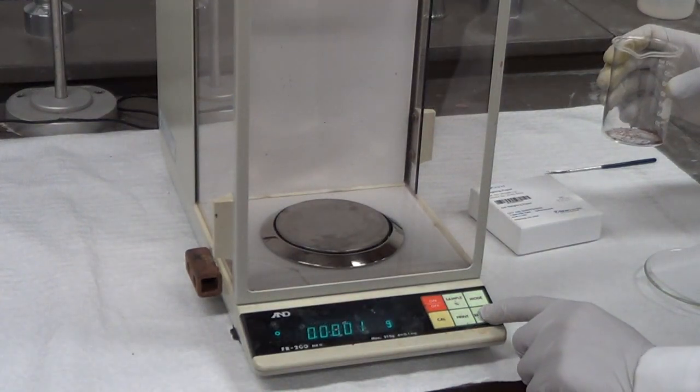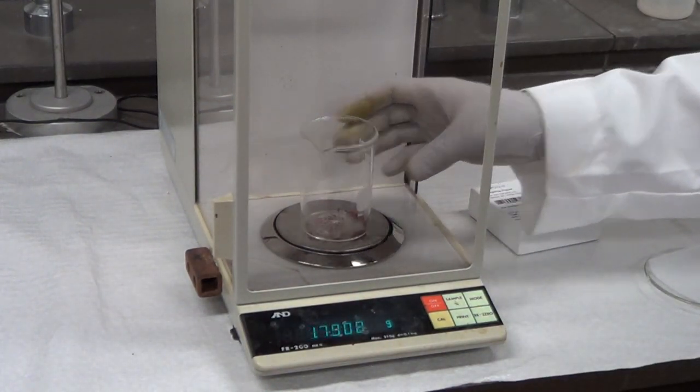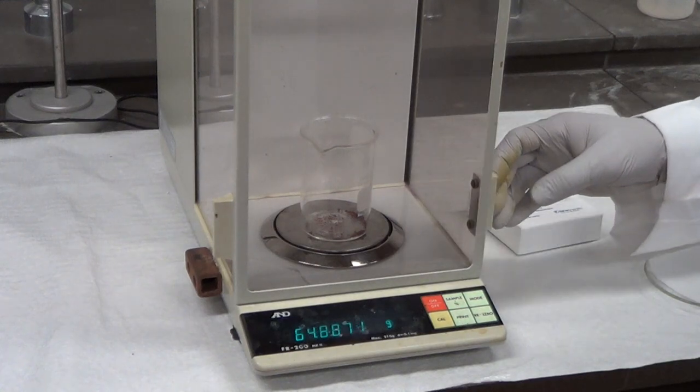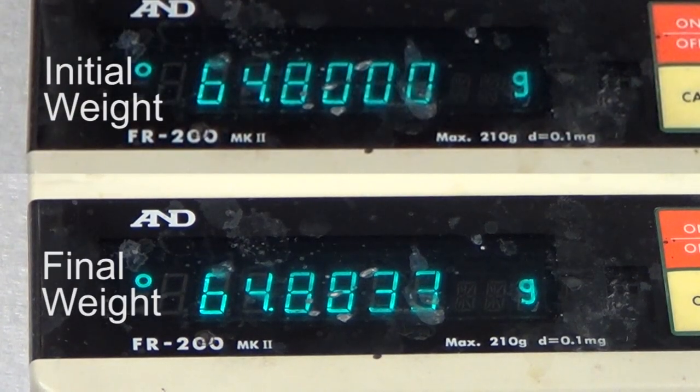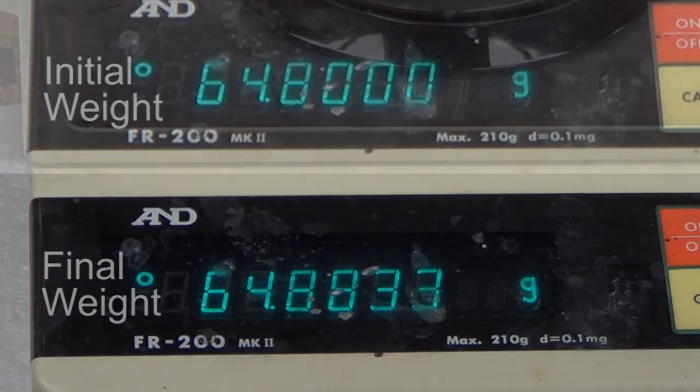We then recorded the weight of the beaker. The difference in the initial and final weight will give us the weight of the precipitate.